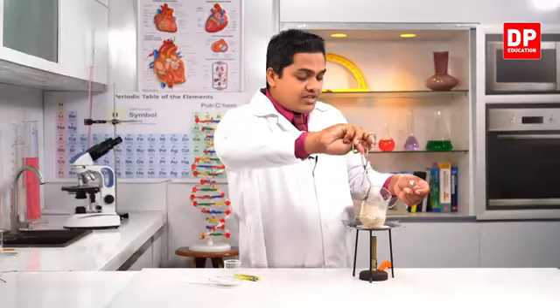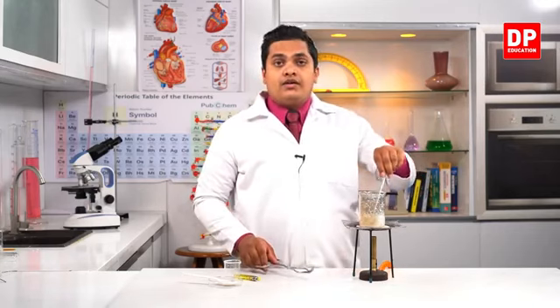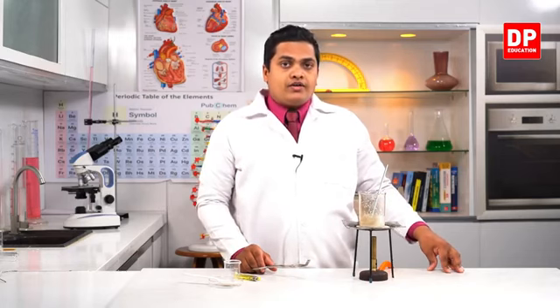Therefore, that's why we can get all the salt back into the beaker when I vaporize the water. So it's clear to us that dissolving salt in water is just a physical change.